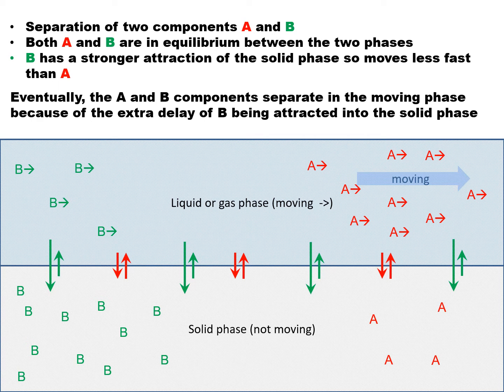If we take a look at the diagram, A and B were in a mixture and at equilibrium when they were put in the stationary phase. However, once we connect the plate with the mobile phase, it will start to move up in the TLC or down in the column chromatography, and then the compounds will start to separate.